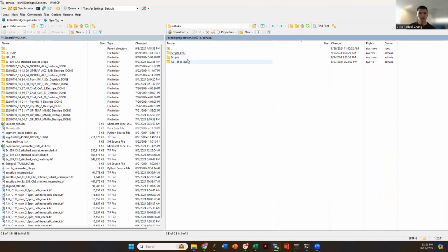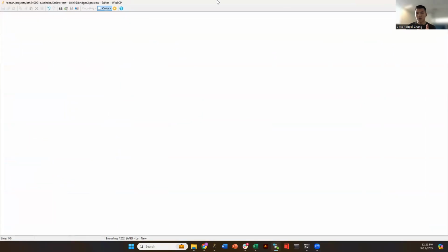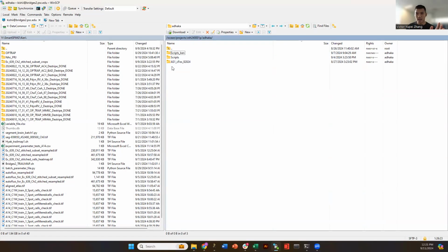I have a quick question. So that classifier, what I would do is actually I would take the cropped images from all of my brains and put it in Ilastik in one sitting, and then basically classify a few cells from every cropped image from every single brain to create one single classifier. That is what I recommend.